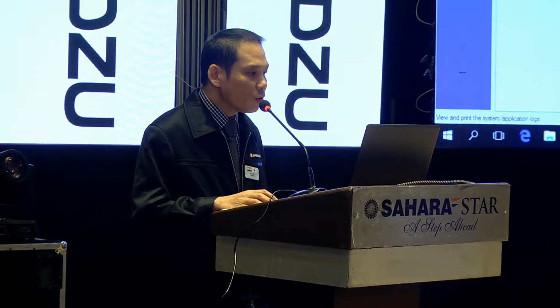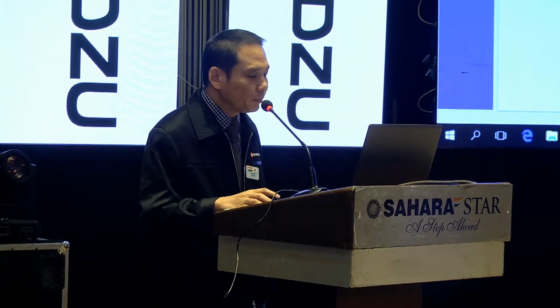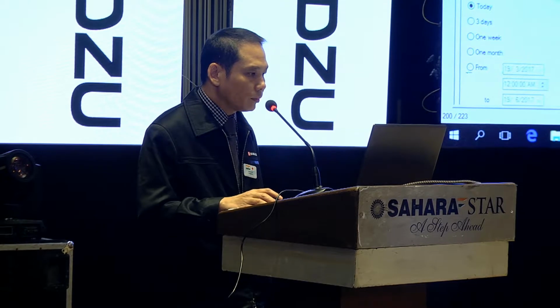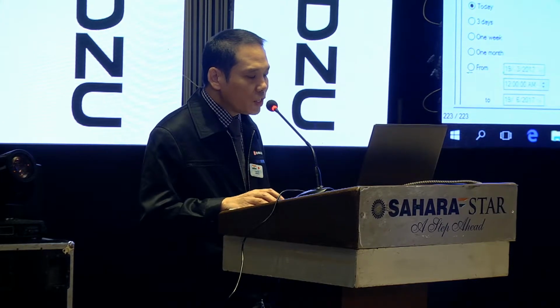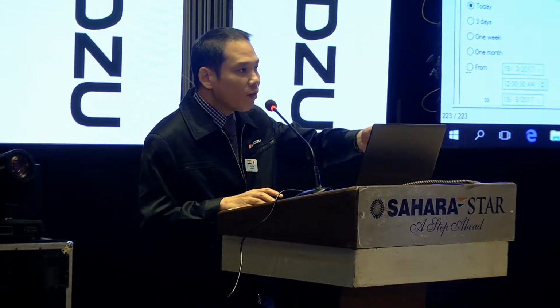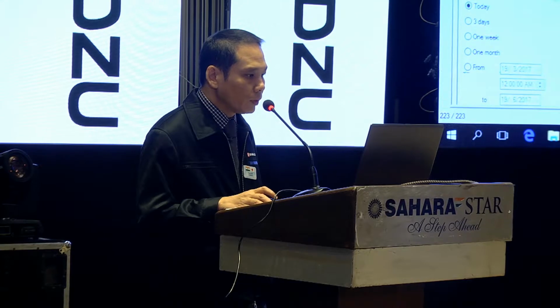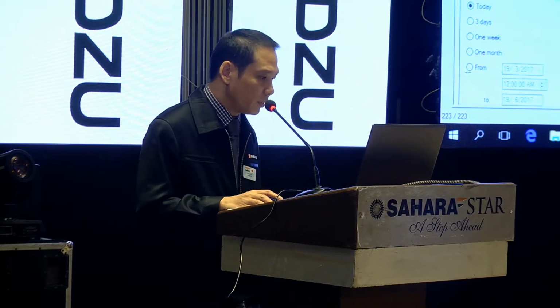So, just now I told you there's a log file, right? So you can view the log files by using the log browse function here. Every information is recorded in the log files. So if the inspector wants to inspect or do an audit trail, these log files will provide this audit trail. Okay. That's all for my presentation.